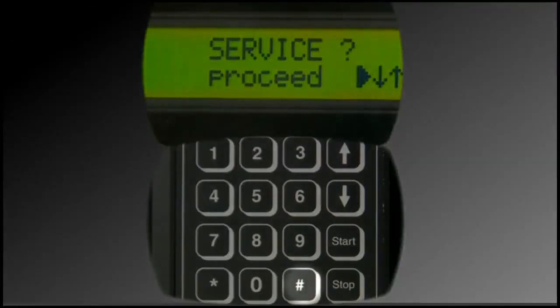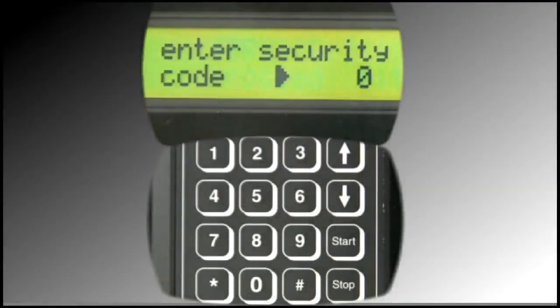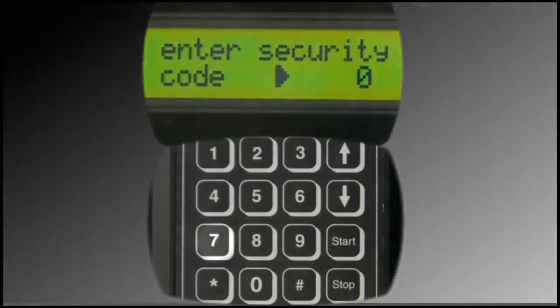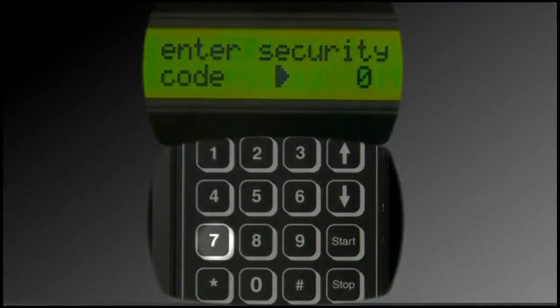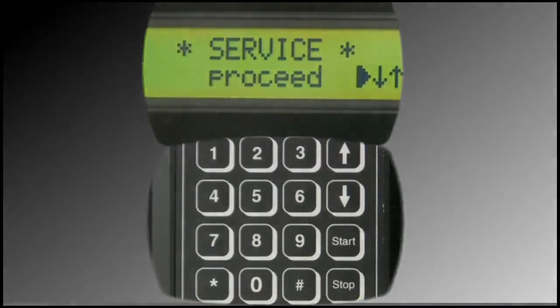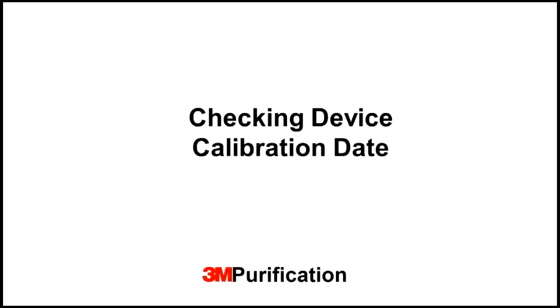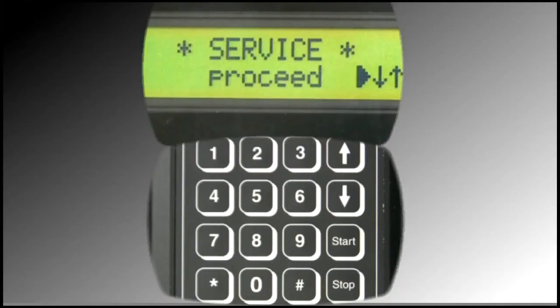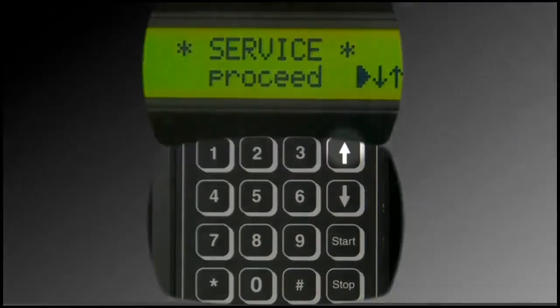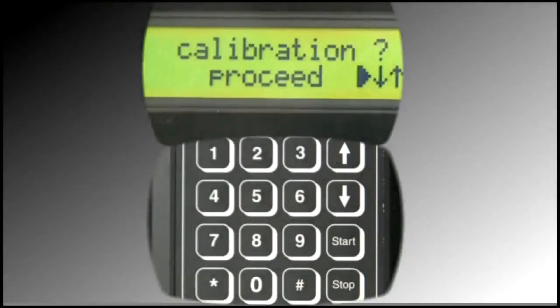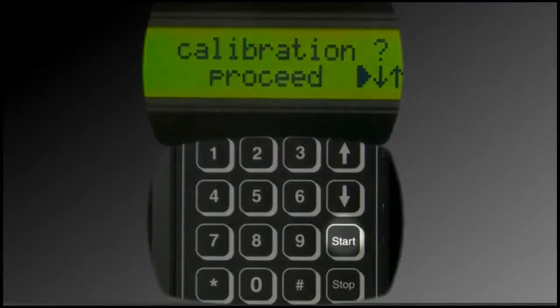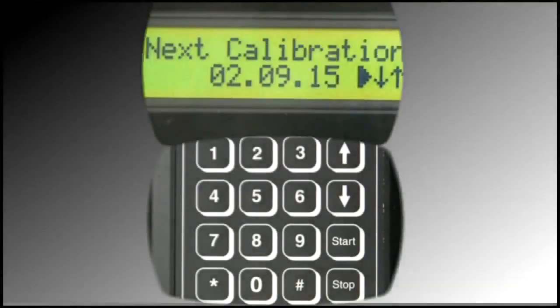Press the Pound icon, then press the 7 button. Press the Up arrow two times. This is the calibration menu. Press the Start button to view the next calibration date.